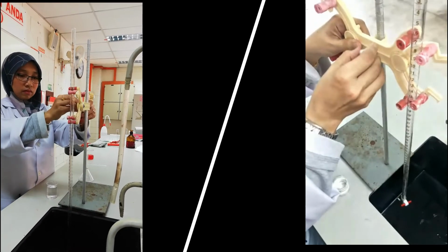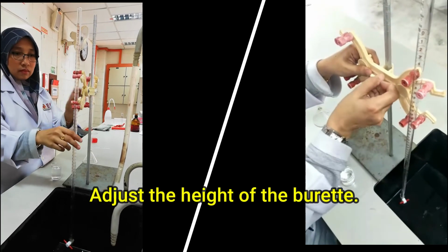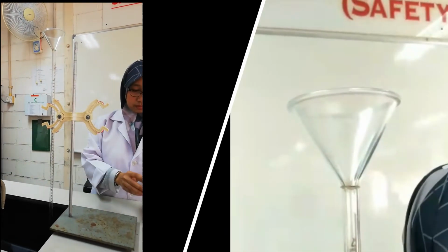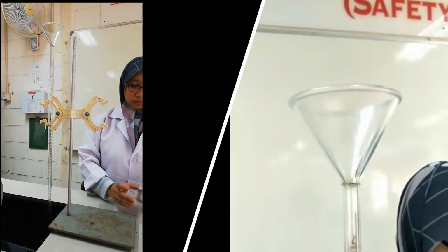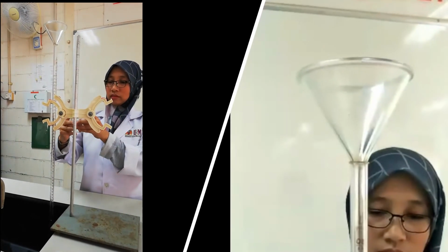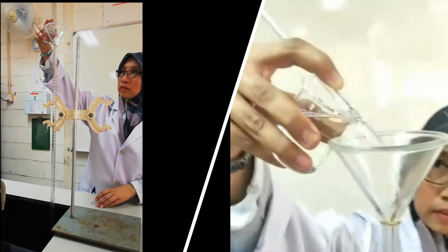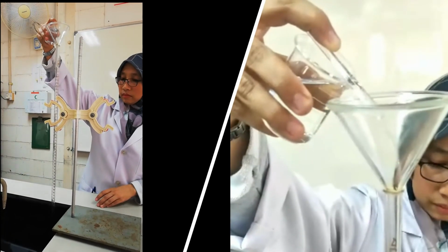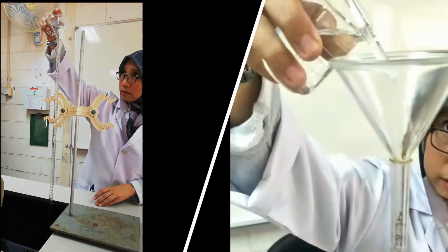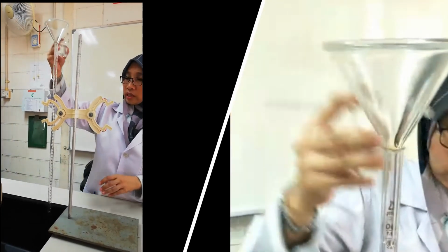Secure the burette in the upright position using the burette clamp. Insert the funnel into the top of the burette. Fill approximately 5 to 10 ml of distilled water into the burette. Pour the distilled water in from the top of the burette using a filter funnel. Make sure that the stopcock is closed at the bottom.